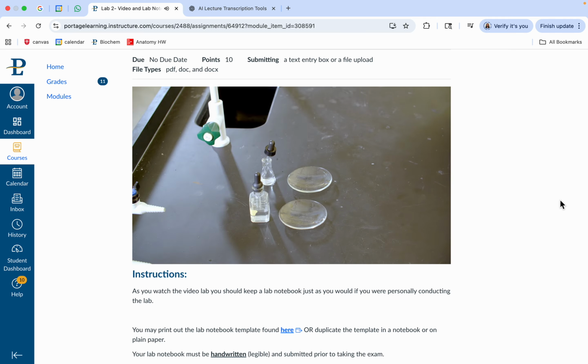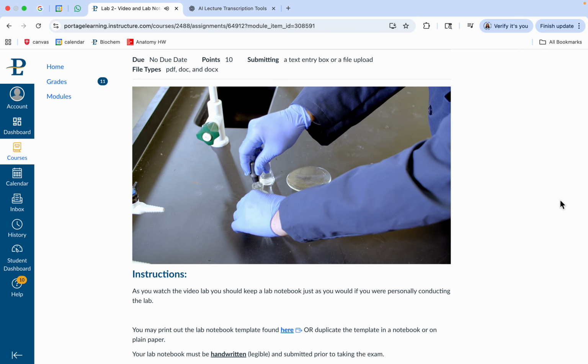All right, and so we'll do that. We're going to, very simply, put a drop of each one of them on a watch glass, and we're just going to see how well they resist flow, because viscosity is really resistance to flow. That is, molecules want to stay together if they are really viscous.